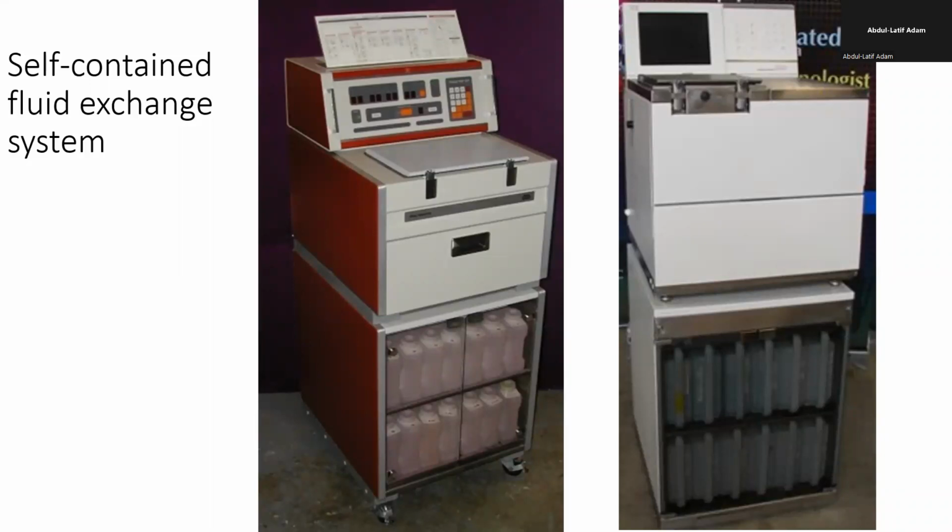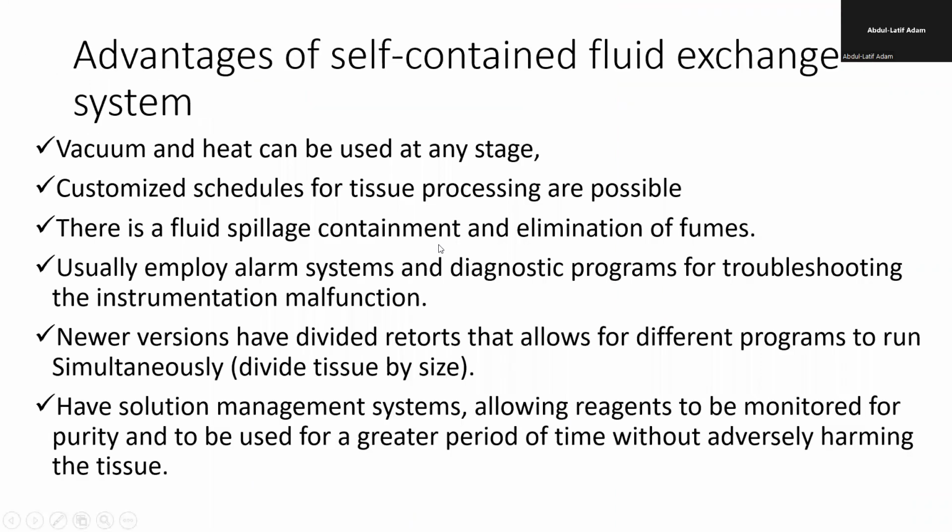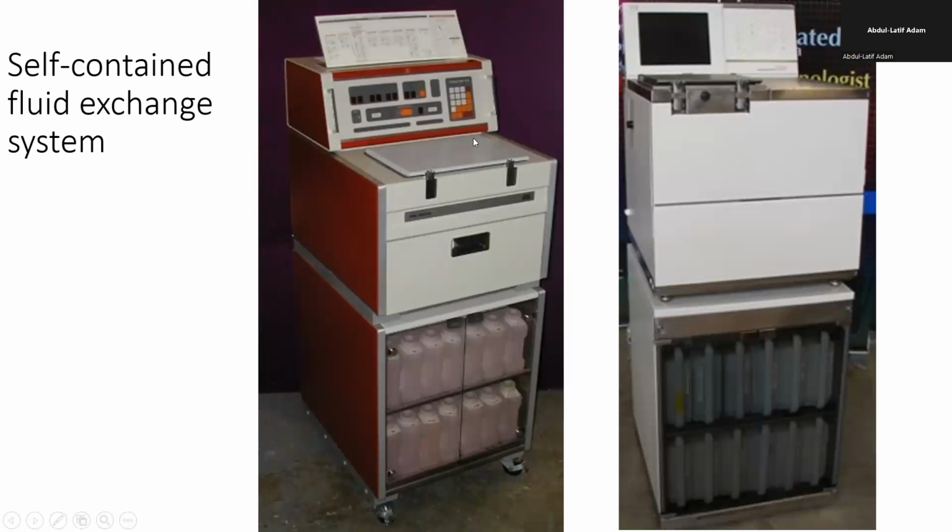Okay, so you put the tissue in this container, a space up here, and then the fluid will just move in. There's a tube that will cause the movement of the fluid inside. So this one will go, then after staying for the number of hours you have set on the monitor here, it will come back and the second one will go up. That is fluid exchange. This is another type of the fluid exchange. There are several of them.